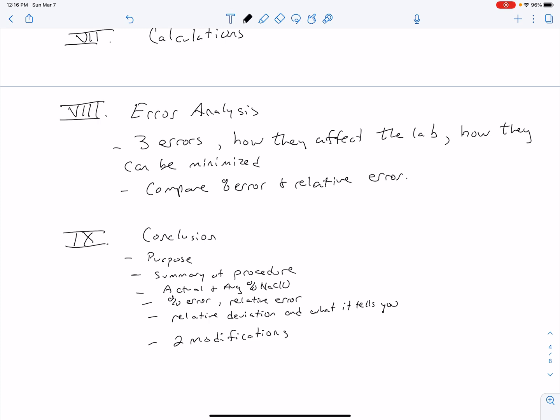2 grams of potassium iodide and 2 milliliters of hydrochloric acid were added. The solution was titrated with sodium thiosulfate until it turned from red to light yellow. A dropper of starch was added. The titration was complete when it went from dark blue to colorless. Those are the kind of things that we are looking for in a summary, where it just doesn't give the whole thing. It just talks about what you did in about 2 sentences or so.